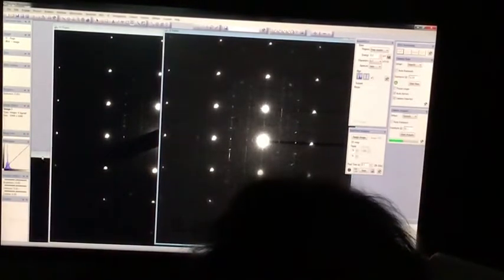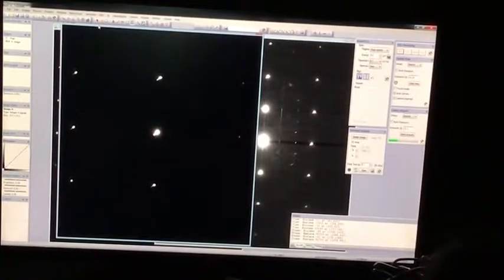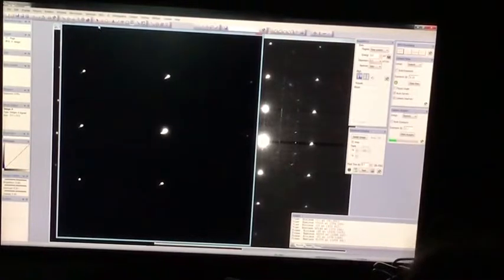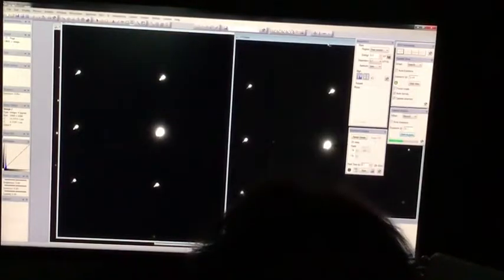Make this view live. Nope, that's too low. Okay. Okay. That was right about there. Analysis, statistics, minimum, maximum. Okay, that's much better. Start acquire. And analysis, statistics, minimum, maximum. Oh, it's saner.